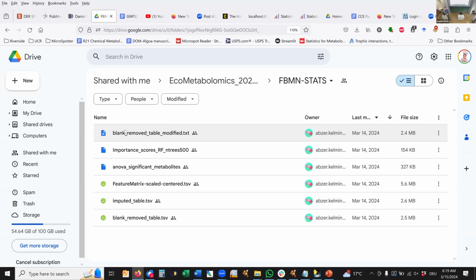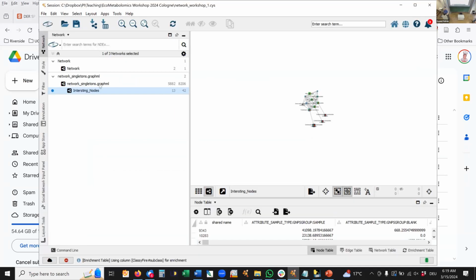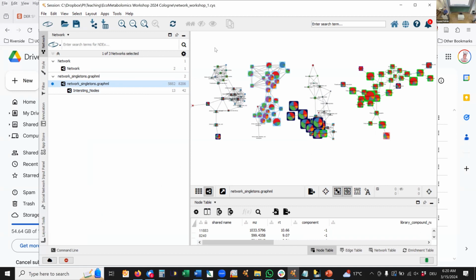And that we want to do in a second, because there's a couple of steps we may need to do and transform these data frames before we can bring them into Cytoscape. Okay, I asked you before who has the networks in Cytoscape. Do all of you have the networks open now in Cytoscape? Okay, if not, that's the time now to open it. I hopefully still have it open. Yes, that's where we basically left off yesterday.